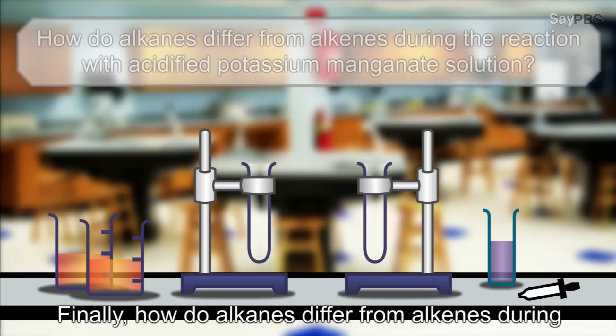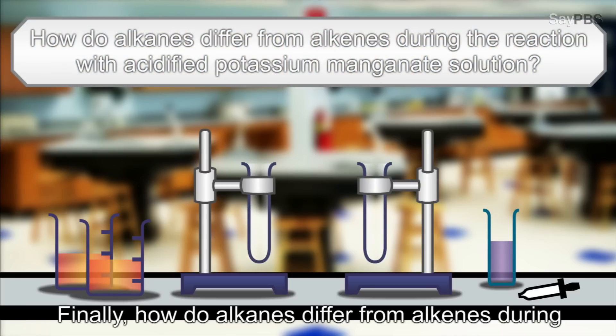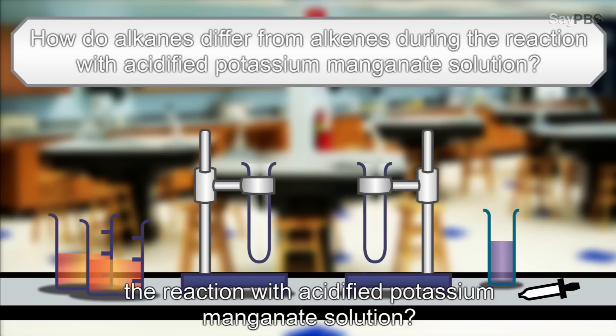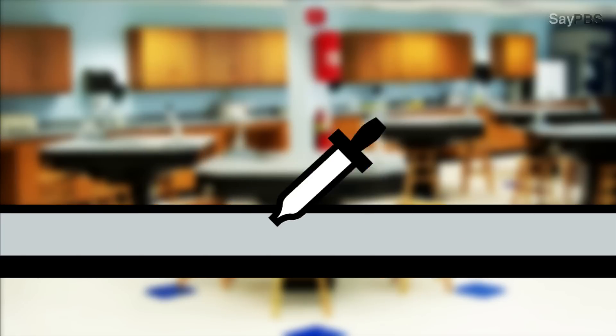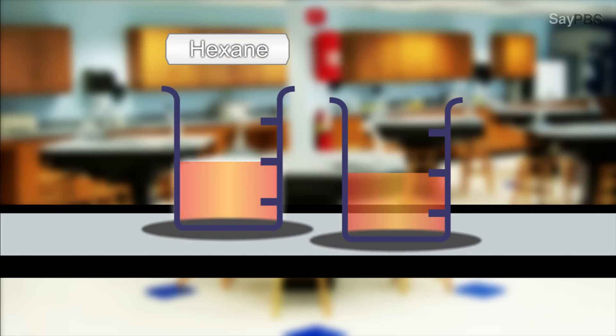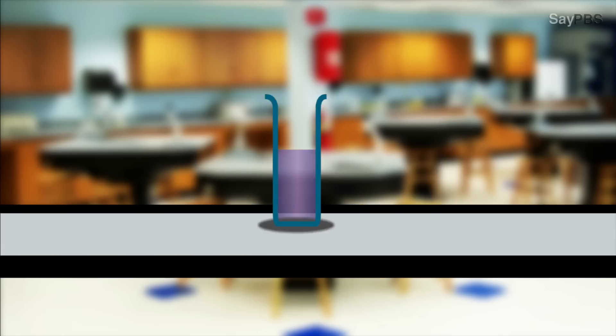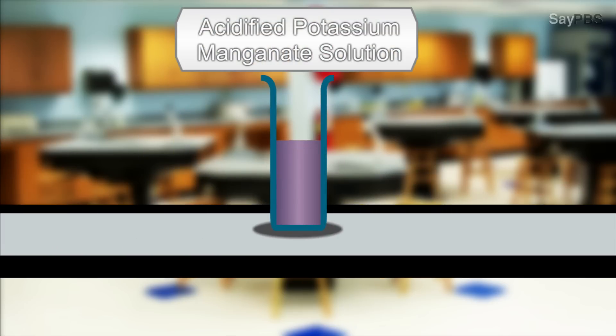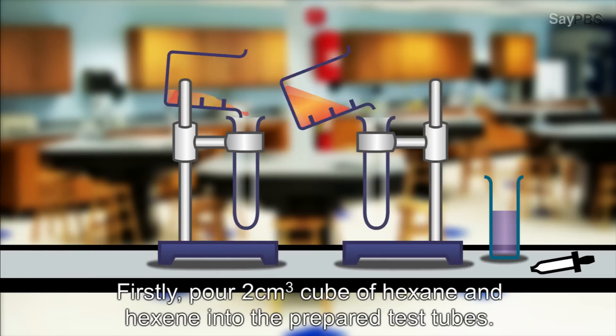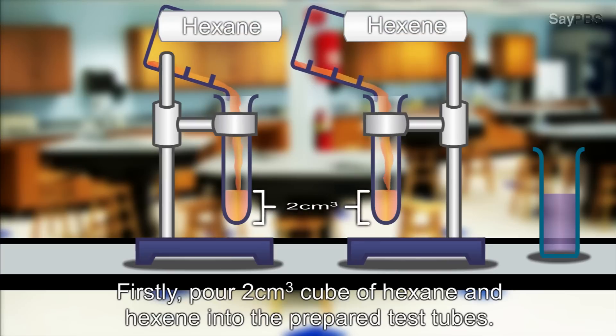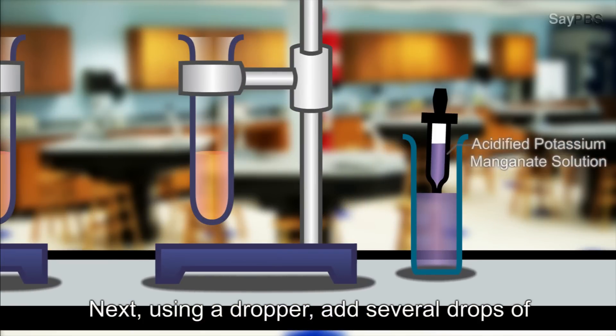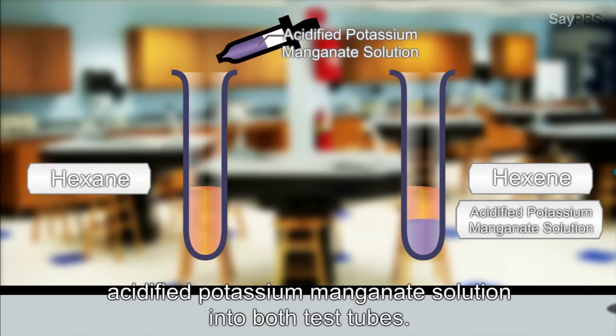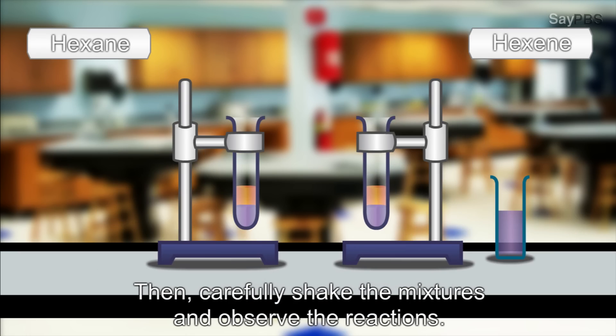Finally, how do alkanes differ from alkenes during the reaction with acidified potassium manganate solution? The apparatus needed for this experiment are test tubes, dropper, hexane, hexene and acidified potassium manganate solution. Firstly, pour 2 cubic centimeters of hexane and hexene into the prepared test tubes. Next, using a dropper, add several drops of acidified potassium manganate solution into both test tubes.